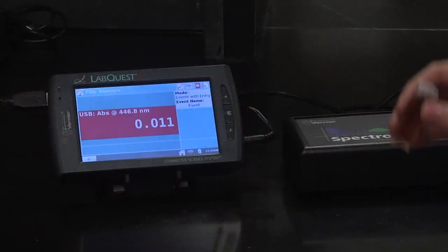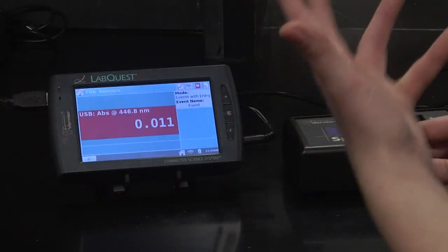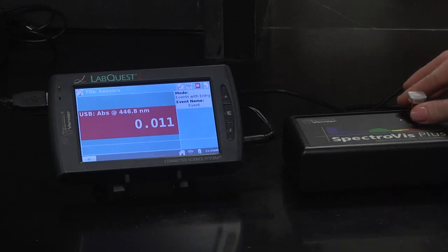Now that we've filled our cuvette and we've calibrated it, we're going to place the cuvette in there and take our measurement.